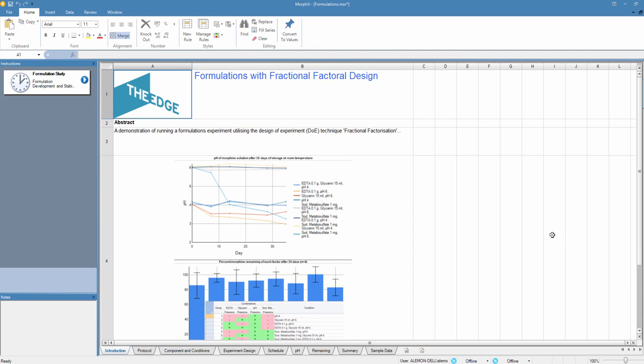Welcome to this BioRails video. In this example we're going to use this Morphit binder in order to evaluate the stability and pH variability of a set of standard formulations of morphine using a fractional design.